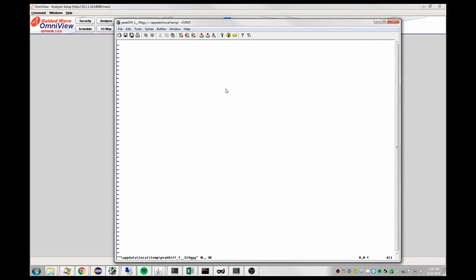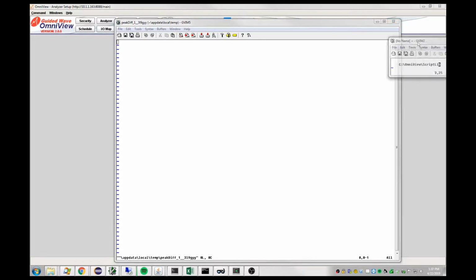The script needs to be written in the Python scripting language, version 2.7 or earlier. If you're familiar with Python, you know that you must import the code modules containing the functions you intend to use in your script. So if you want to call a function that lives in another file, you have to import it first. We do provide a library of functions for you to use.